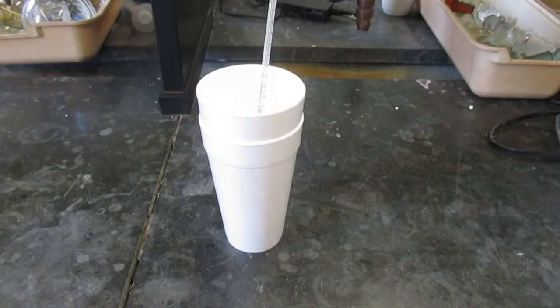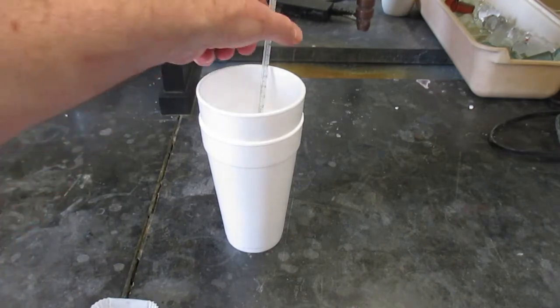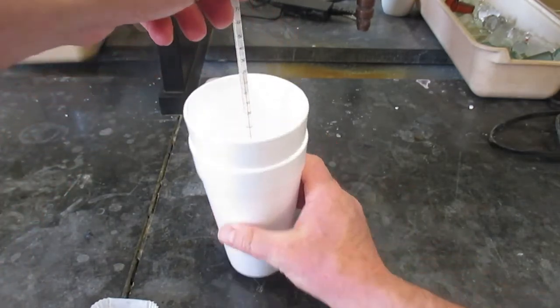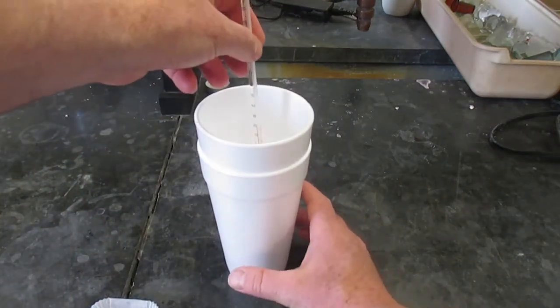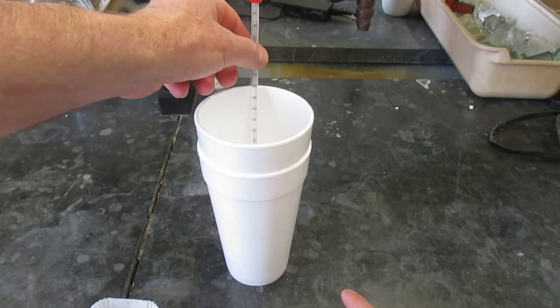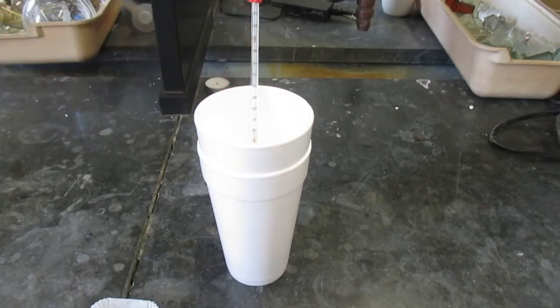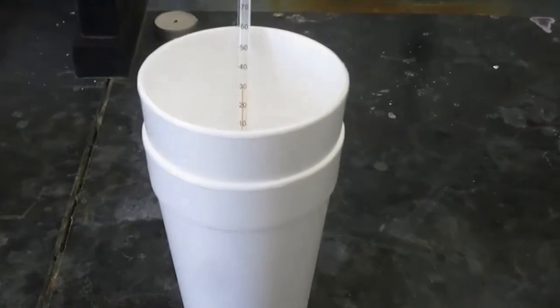What we're going to do is add in the magnesium, and that's going to dissolve. You can kind of hear it. What you're hearing is the magnesium reacting with the HCl to produce hydrogen gas and magnesium chloride. And so the sound you hear is that of the hydrogen gas being produced. And as you can see, you may not be able to see because of the amazing quality of this camera.